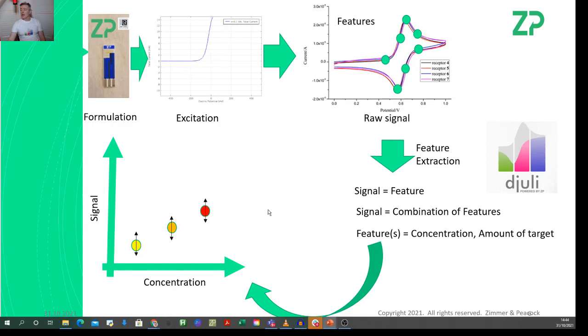Now, the more replicates you do, you can then start including some error bars on it, so you can understand, I have a signal that's versus concentration, and this is my uncertainty because of my irreproducibility, probably of manufacturing, or my irreproducibility due to my experimental setup. And then you can also have a sense of how strong is my signal versus concentration, which we often call sensitivity.